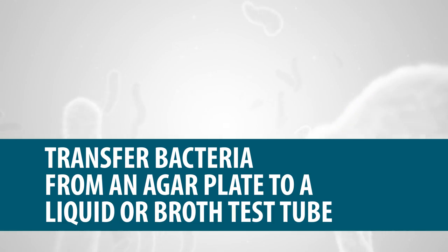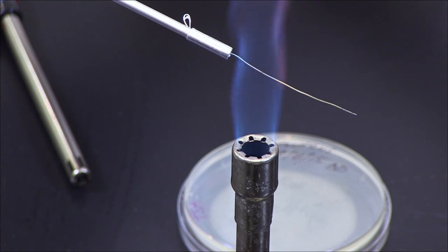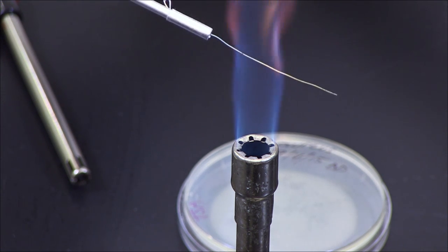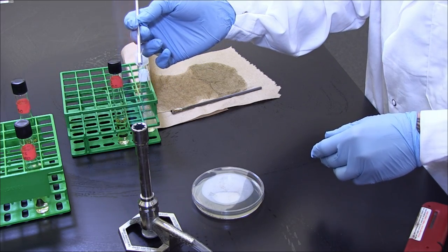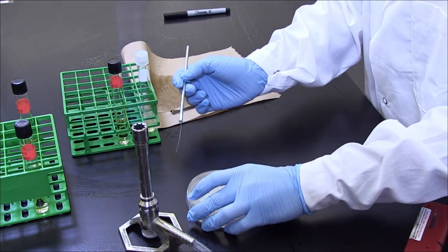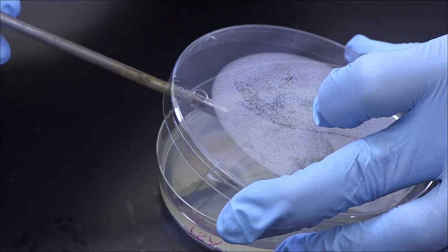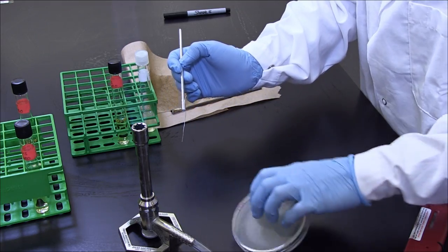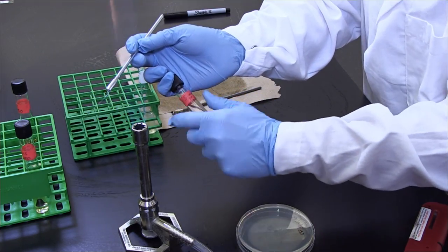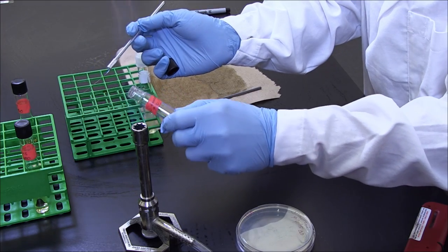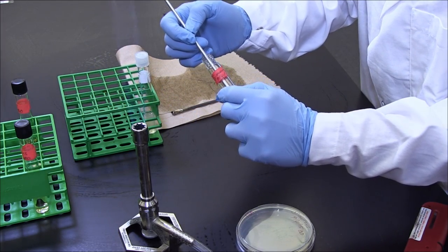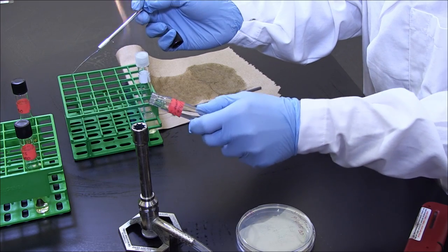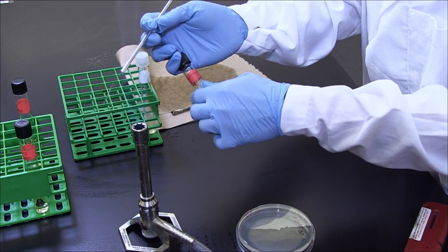Transfer Bacteria from an Agar Plate to a Liquid or Broth Test Tube. Repeat the first few steps from the previous lesson to sterilize the inoculating needle and prevent airborne contaminants with the agar plate. Gently rub the needle over a single colony. Insert the needle into the broth test tube to transfer the bacteria into the liquid. Use the aseptic technique to remove and replace the lid of the broth test tube.